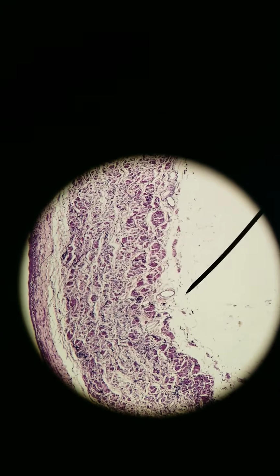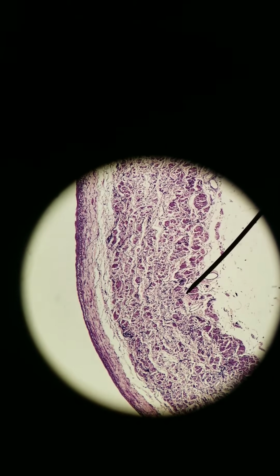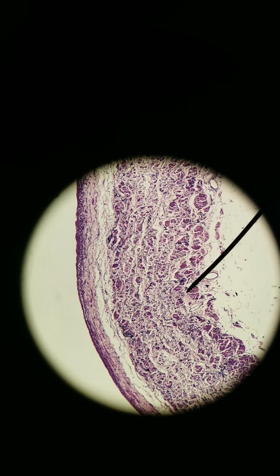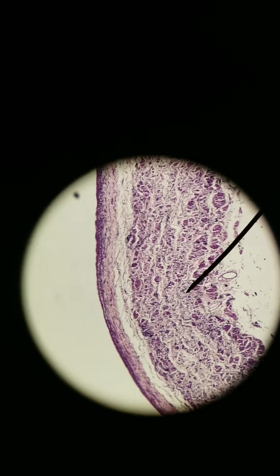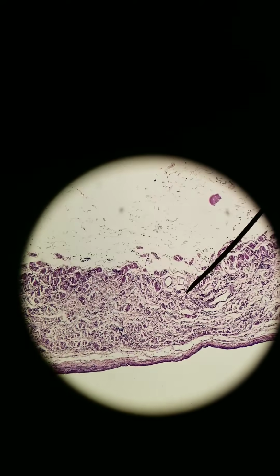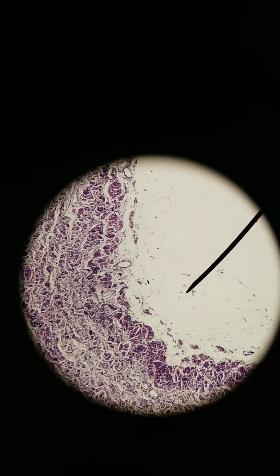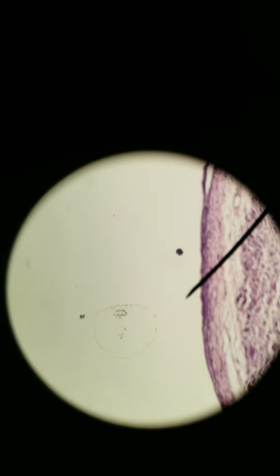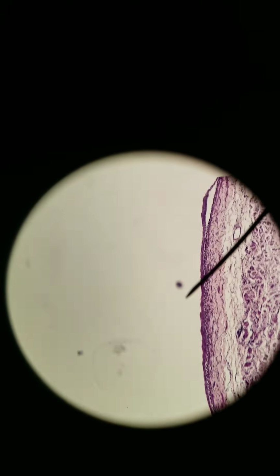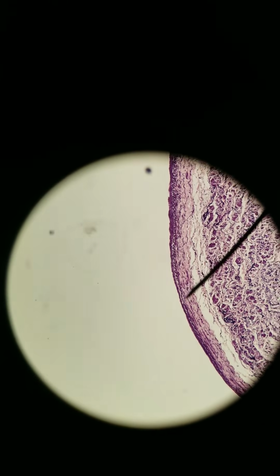is a large-sized vein, has the same basic layers as the aorta, but it does not have an internal or external elastic membrane. So how do you tell the lumen? Same idea. Don't go by the curve alone, because this is actually the opposite of what you think. See how it's curved right now? You'd think that this is the lumen over here. It's not. See how disorganized this is? That's the tunica externa. This side is the lumen side. This is tunica externa, much more disorganized. This is the lumen side.